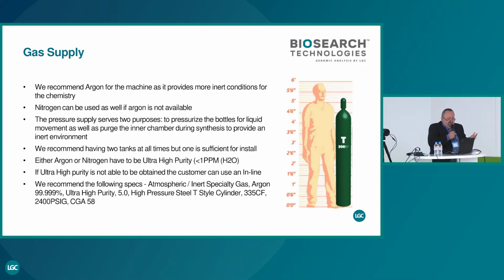But for a 20-mer, it's okay. But if you do a 50-mer, 98.5% average gives 45.7% at the end. If you have 99.5%, it's 77%. So you see a 30% difference, just a little 1% difference during every cycle. You can imagine what the difference will be if you do a 100-mer. So any percent you win during the synthesis is really an advantage.